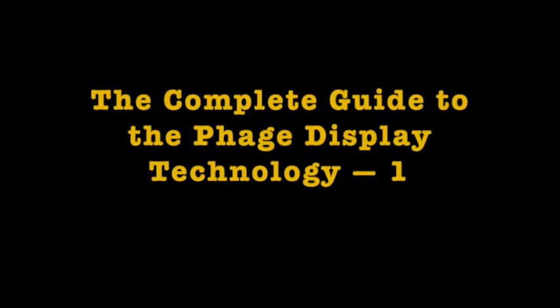2. Principle of phage display technology and common methods. Genes encoding signal peptide of capsid protein and genes encoding capsid protein polypeptide in bacteriophages can be cut through genetic engineering technology. And then insert the gene fragments encoding exogenous polypeptides or proteins between, so that the exogenous polypeptides or protein sequences can form fusion protein molecules with phage capsid proteins to be expressed on the surface of the phage under the guidance of signals. This process is called display.